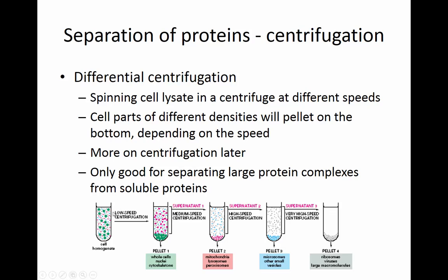So essentially what you've done is you've separated large protein complexes and even whole cells from soluble proteins. And you can certainly do that, and there are a variety of ways to do that that we won't get into.